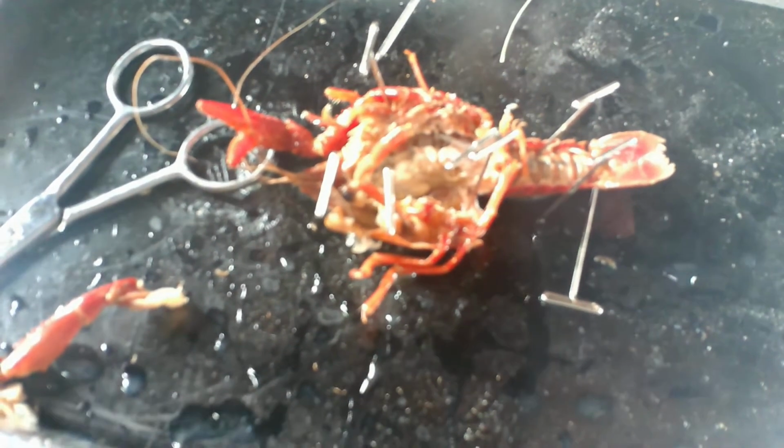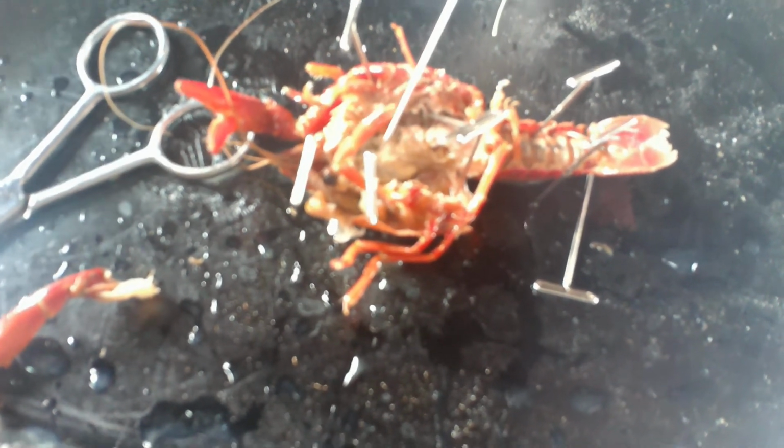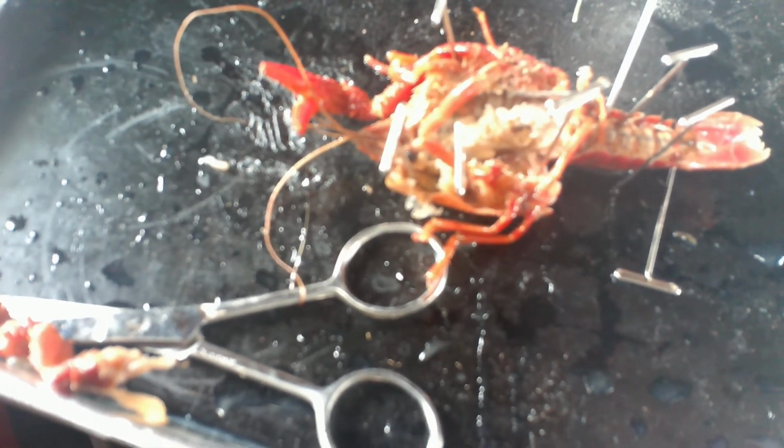All right. So if we're starting all the way up at the top here, this really broad part is called the cardiac stomach. Then moving down a little bit this way and underneath, we'll have the pyloric stomach. Then there's a tube that comes all the way down this way, which is the intestine. And then we come all the way down here to the very back to the anus.